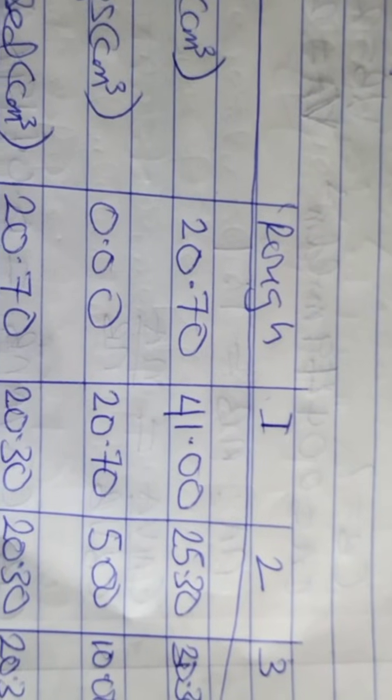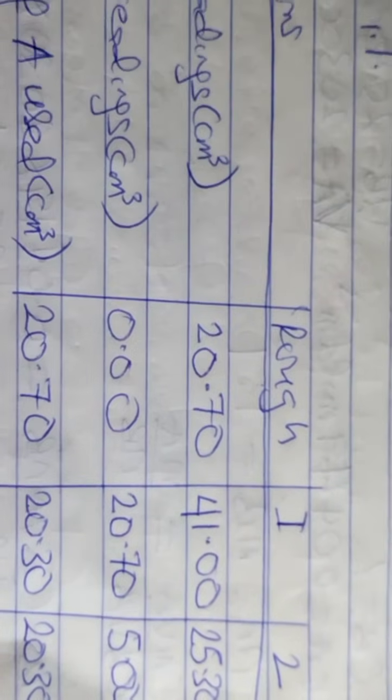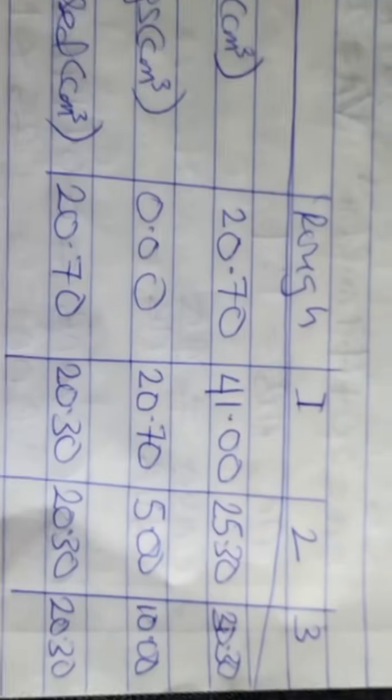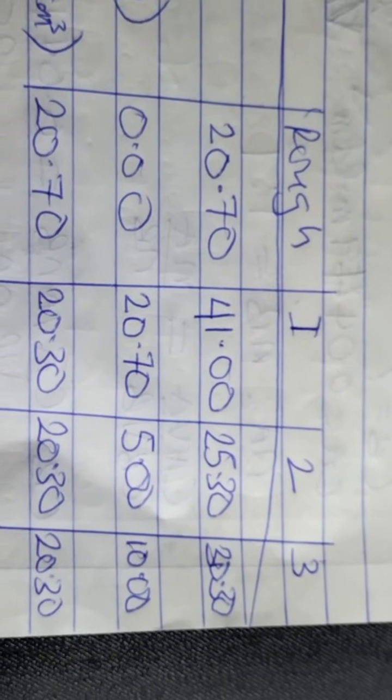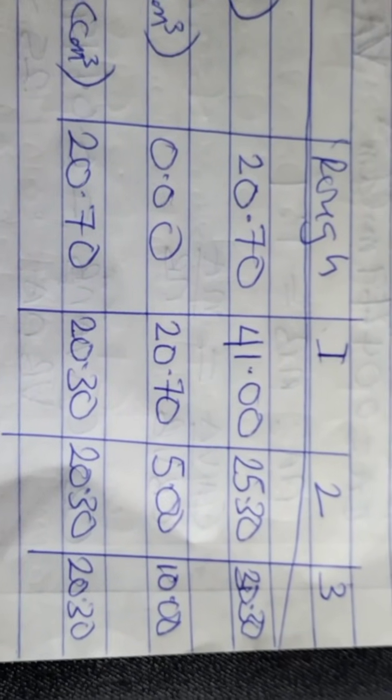Then under the rough column, we have 20.70 as final, 0.00 as initial. You subtract, we have 20.70 as volume of A used, that's the titer value. Then for 1, we have final 41.00, initial 20.70.